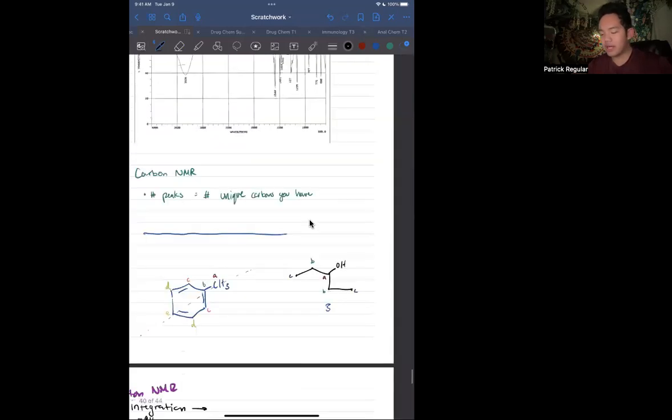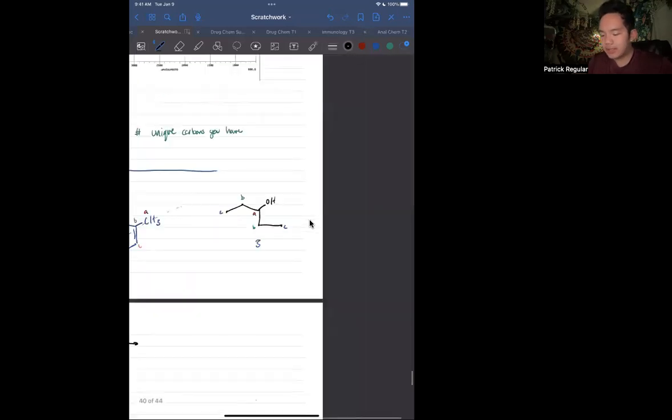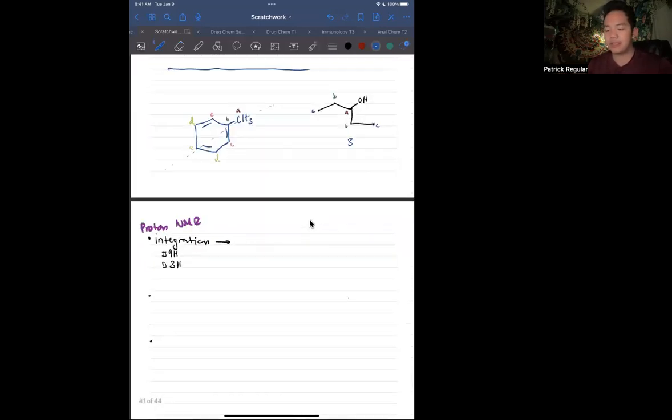So if you have proton NMR, like something like this, where let's say you had a triplet, the area under the curve, if you were to integrate, take that area under here, let's say that was 3H, 3 hydrogens, that's how much it's relatively worth. We'll talk more about it as you do practice, but actually, we already covered that. Integration's pretty simple.